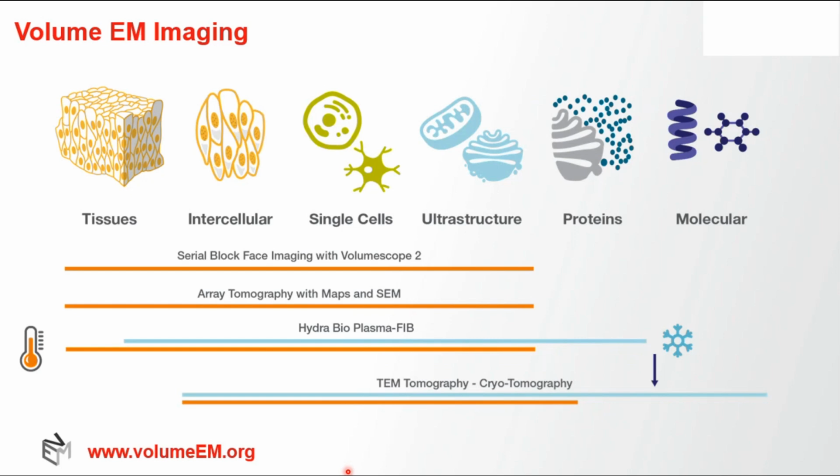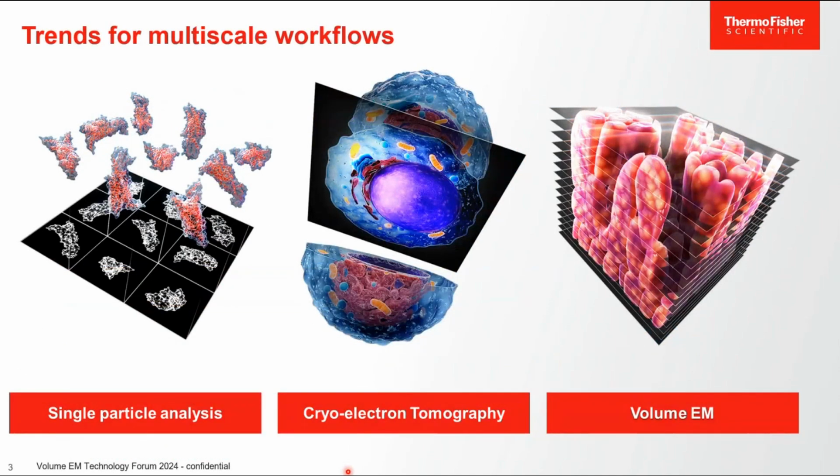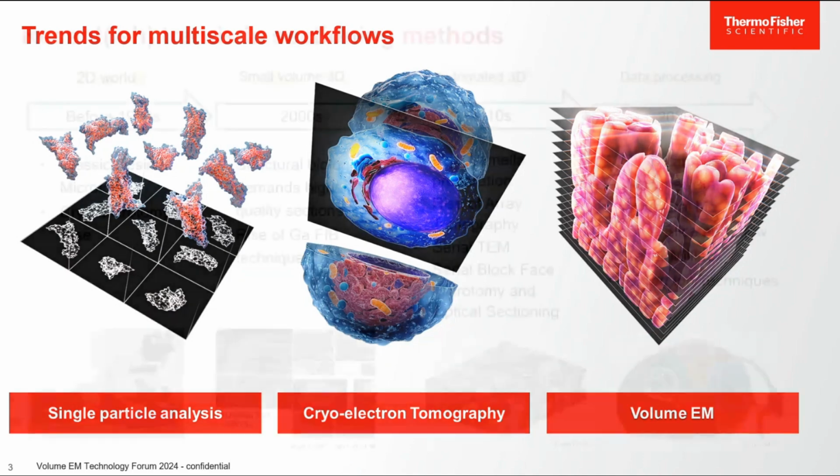I think one of the points for us is we're really seeing trends in multi-scale workflows coming now. So people aren't just interested in getting SPA results. They want to be able to paste that back into the tissue volume and understand what the mechanisms are. And so I think what we're aiming to do, certainly at Thermo Fisher, is span that space and really try and integrate the different workflows. So that's what we're doing. Okay, let the contention begin.